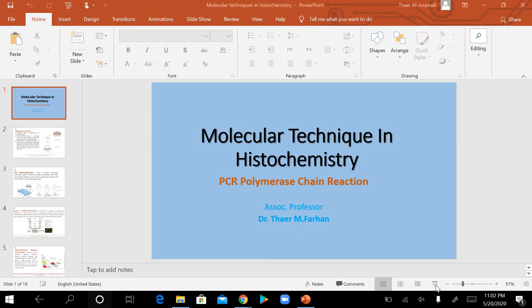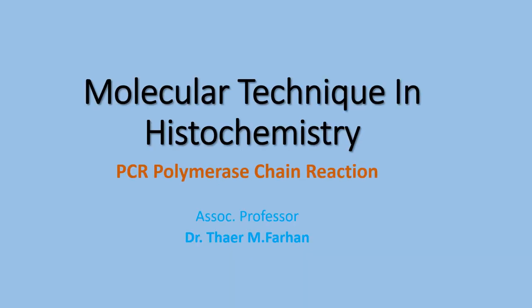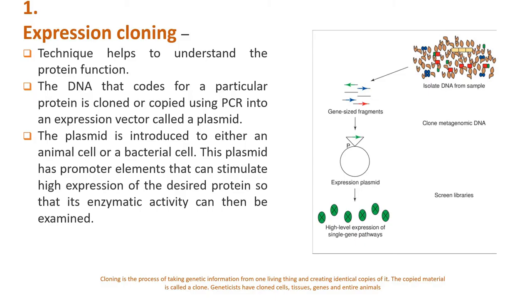Assalamu alaikum. Our lecture is concerned with the molecular techniques used in histochemical examination, and in particular we will talk about the polymerase chain reaction, the PCR. First of all, we should have some notes about the multiple techniques used in histochemistry.